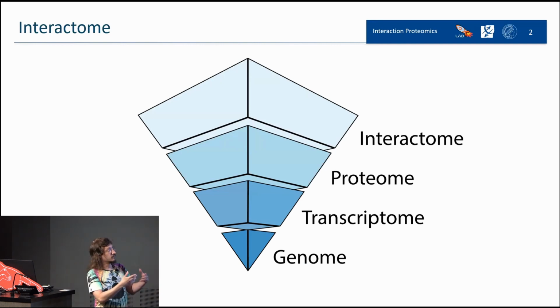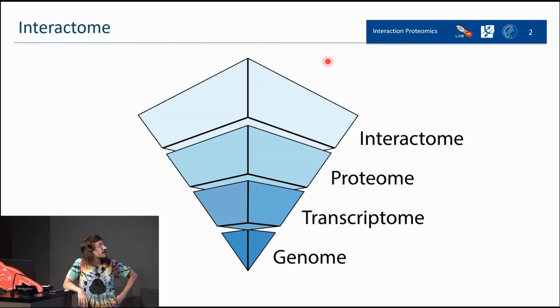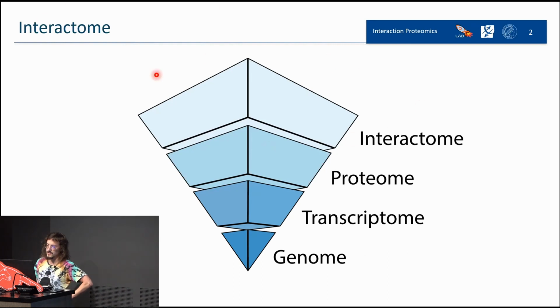You remember this pyramid, and you've seen it turn on the other side. But now to show you again this general idea: we start from the genome, then we have the transcriptome, we go to the proteome, and then lastly, the interactome, that is this branch that comprehends all the interactions that happen between proteins, RNA, protein and DNA, and literally all the types of interaction that proteins may have are studied by this branch here. As you can imagine, it's huge. It's one of the most complex things to study.